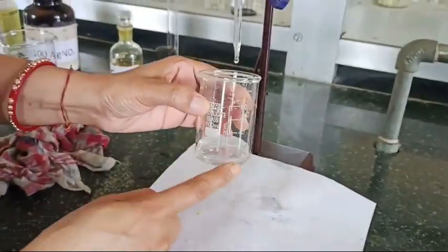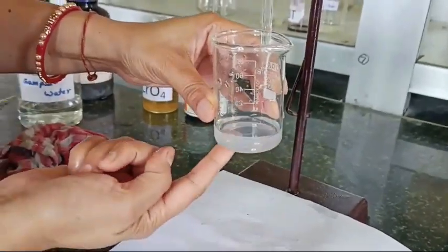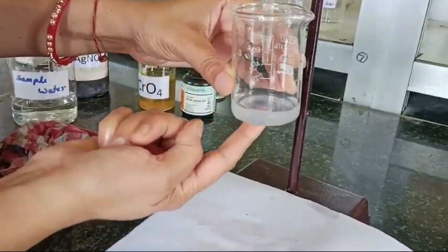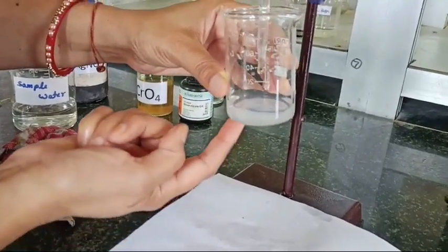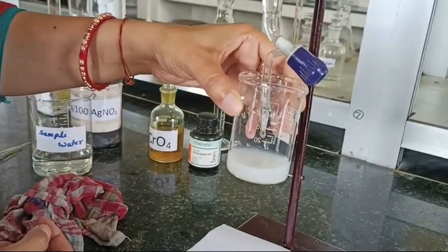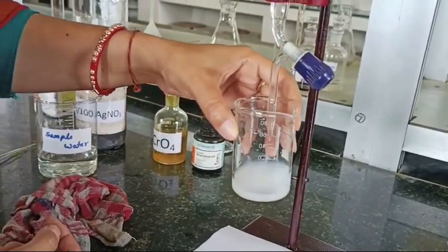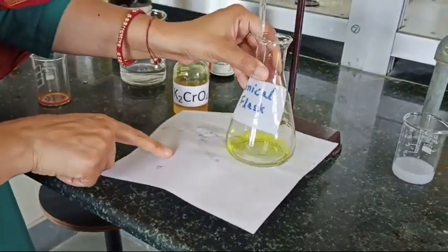I just show you why we have added indicator to this solution. This is NaCl solution and we are dropwise adding silver nitrate to this. So here you can see the turbidity of the solution. It shows that AgCl precipitates are started forming.